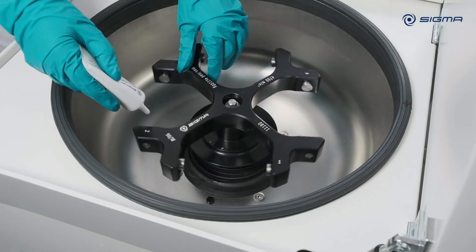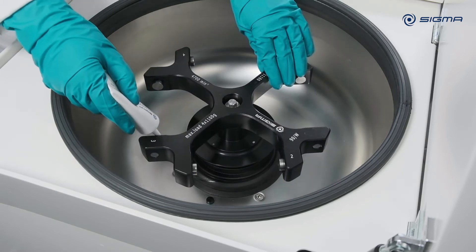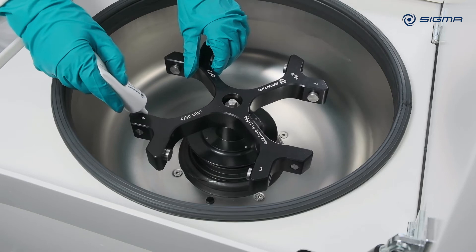If you use aluminium accessories, grease the pins at the end of each cleaning session with a small amount of pin grease. Do not grease the pins if you use plastic buckets.